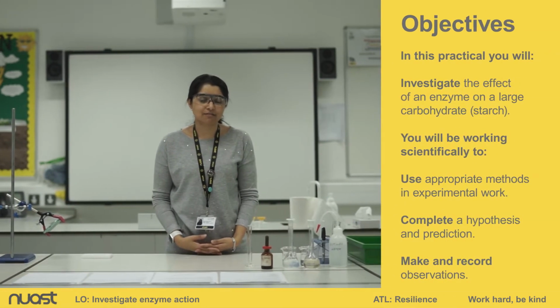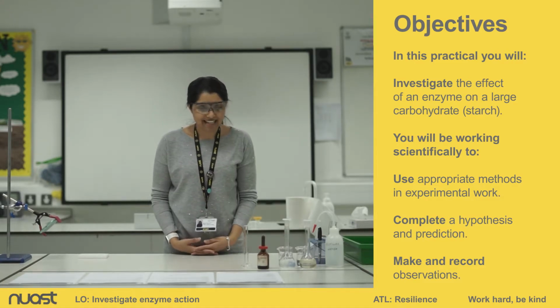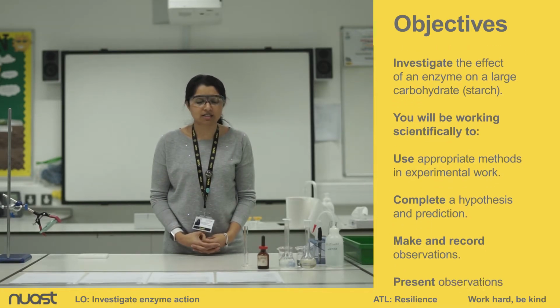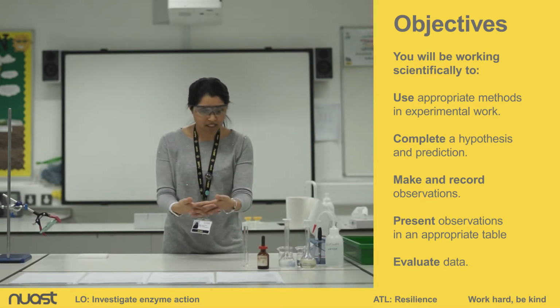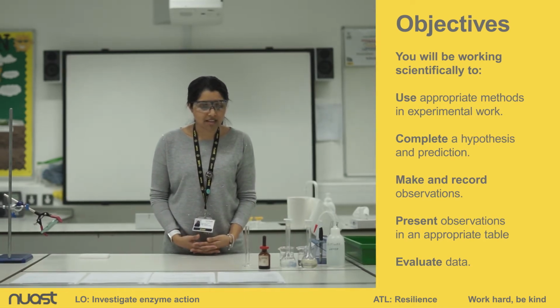My name is Dr Cairns and today we're going to be looking at investigating enzyme action. So our aim for today is to investigate the effect of an enzyme on a large carbohydrate such as starch. You will be working scientifically to use appropriate methods in experimental work, so that'll be me. Complete a hypothesis and prediction, that'll be you. Make and record observations, present observations in an appropriate table and evaluate data. So those last 3 points are all you.